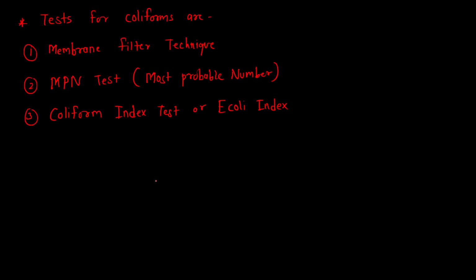Okay, we'll be starting with the first test for coliform, that is the membrane filter technique. So first we'll write down the most important points from here.